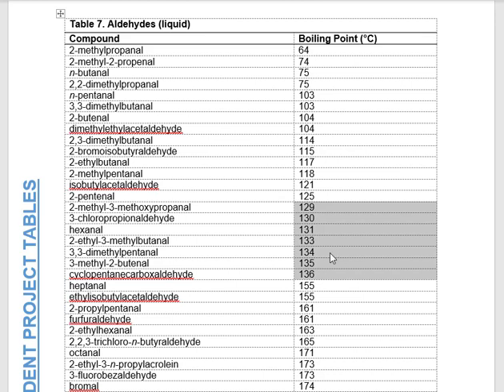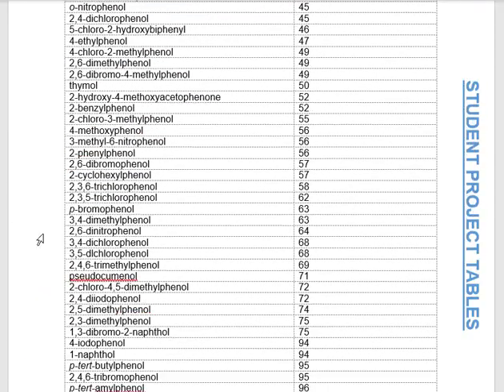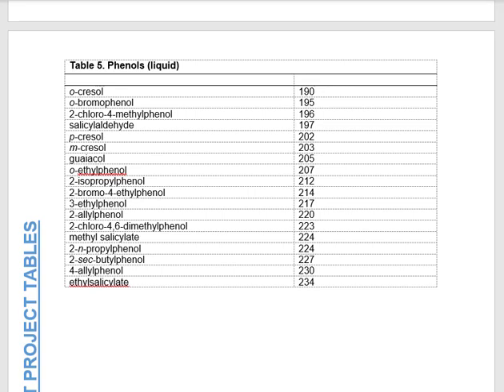How are you going to decide which one of these it is? That's where the spectra will help you. Look at the proton NMR, look at the carbon-13, look at the mass spec. Why do you think you would want to look at the mass spec first? I can pretty much guarantee you that of these 6 options, not all of them have the exact same molar mass. So use the mass spec to tell you the molar mass. It's called a parent peak, people. Go find it.